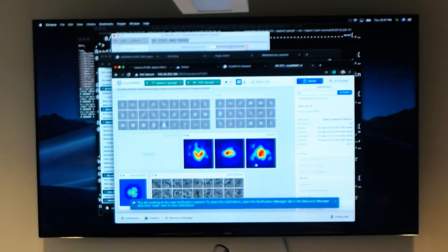Yes. So if you're importing the star file, all you need is the star file, because if the star file and MRC stack are in the same directory, it will already know where the file path is. So all you need is the metadata path, and you can leave the particle data path blank. So we don't need to specify. You would specify the star file.